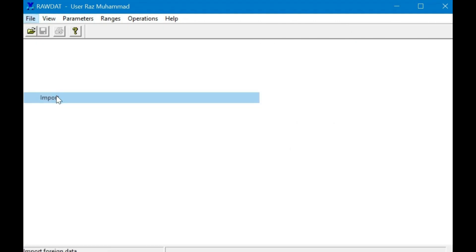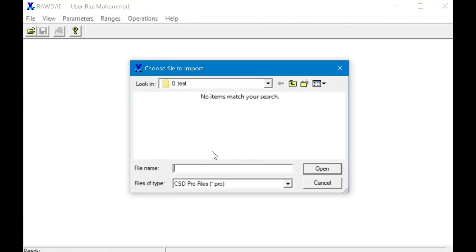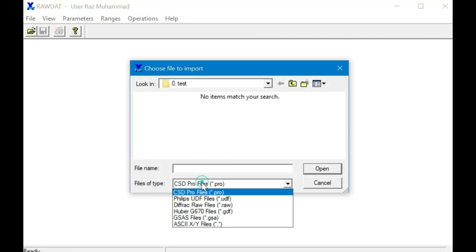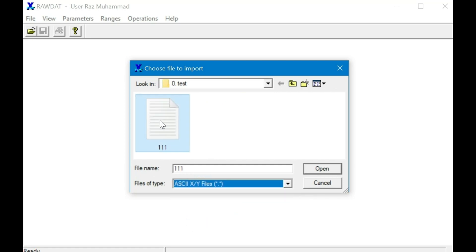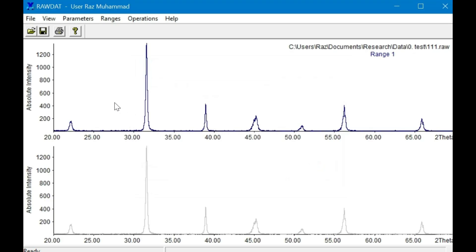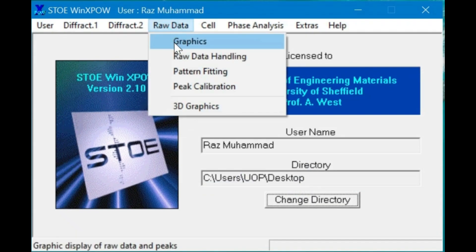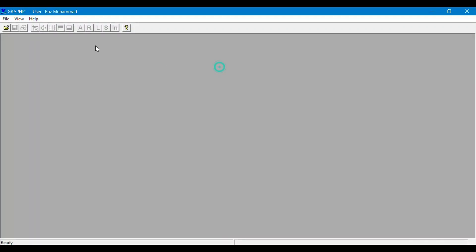We need to convert this data file into raw format or peak format, because WinExpo software supports only raw and peak files for phase identification purposes.